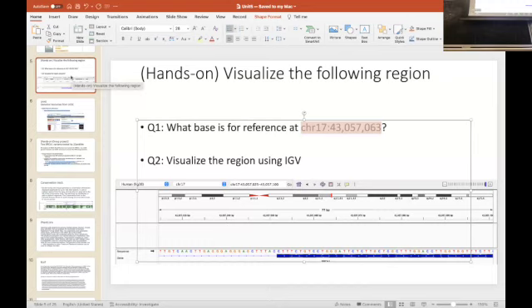If you want to be 100% sure, the gene is located in the reverse direction, and according to the reference genome, if you make it complement, the DNA base in the reverse direction is C. You can say that, but usually without any assumption, if I just ask what the DNA base is for that position, just assume I'm asking for the DNA base in the forward direction and just answer it. Because these kinds of things are assumed in many databases without being clearly written. So you might get confused, but that's the reality.